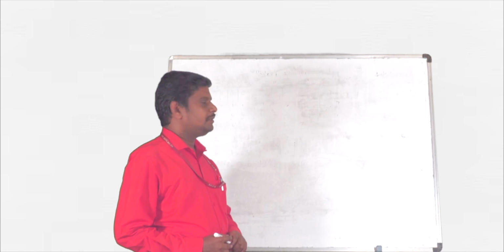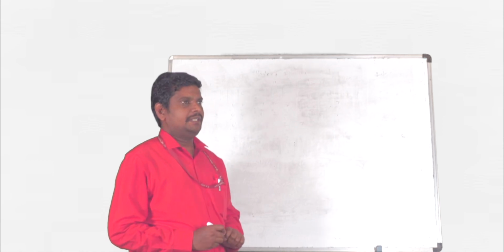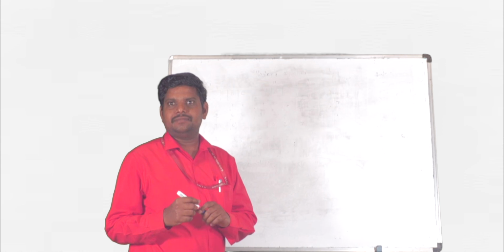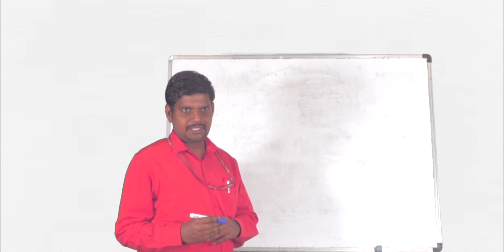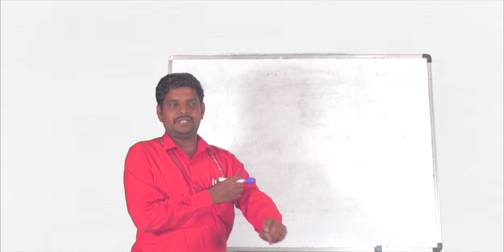Today we are going to discuss conductometric titrations. Actually, there are volumetric titrations, and there are some differences between volumetric and conductometric titrations.